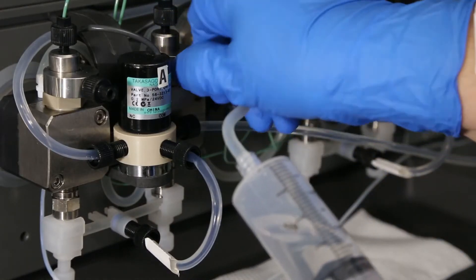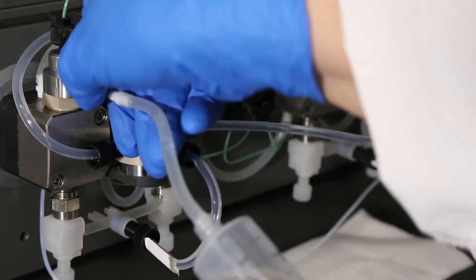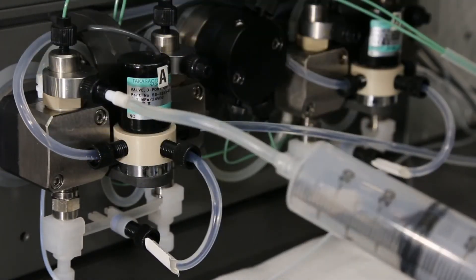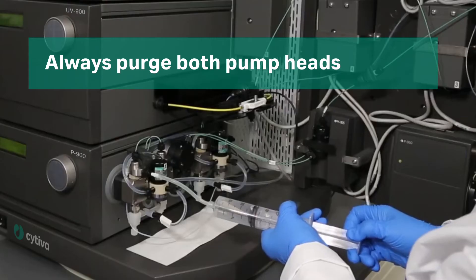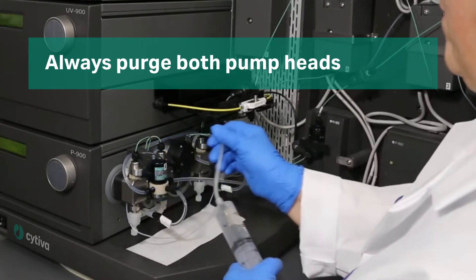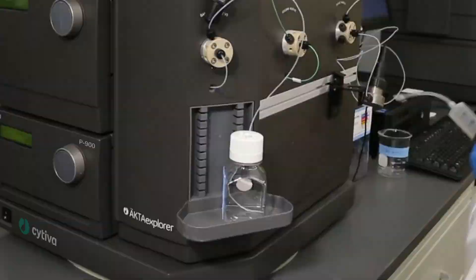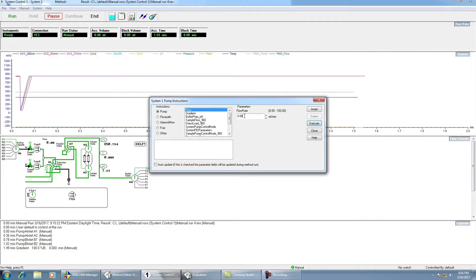Close the purge valve, remove the syringe, and repeat the process on the other pump head. It is very important that you always purge both pump heads when priming the pumps. When you are finished, ensure both purge valves are tightly closed, set a flow rate, and check the flow coming from the waistline to see that it is even and consistent.